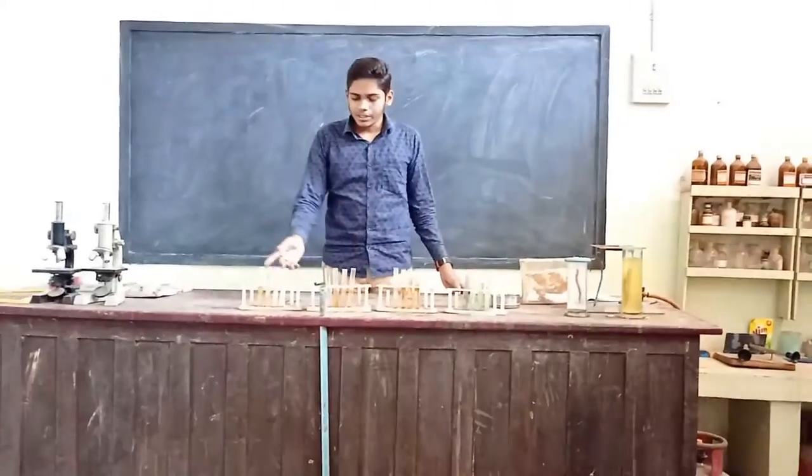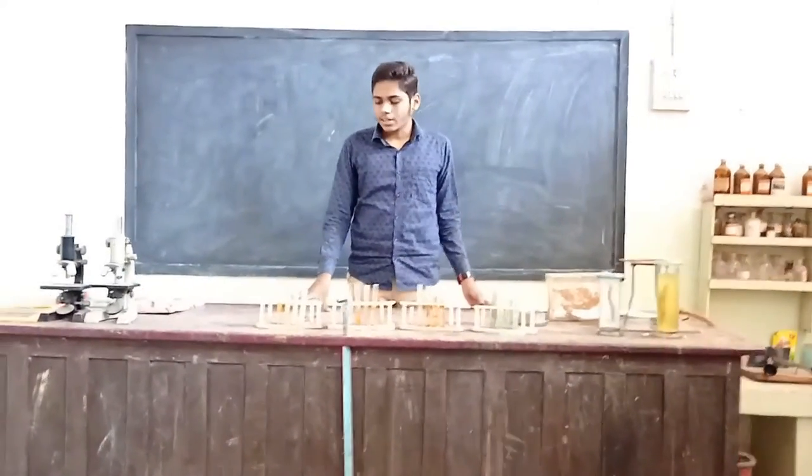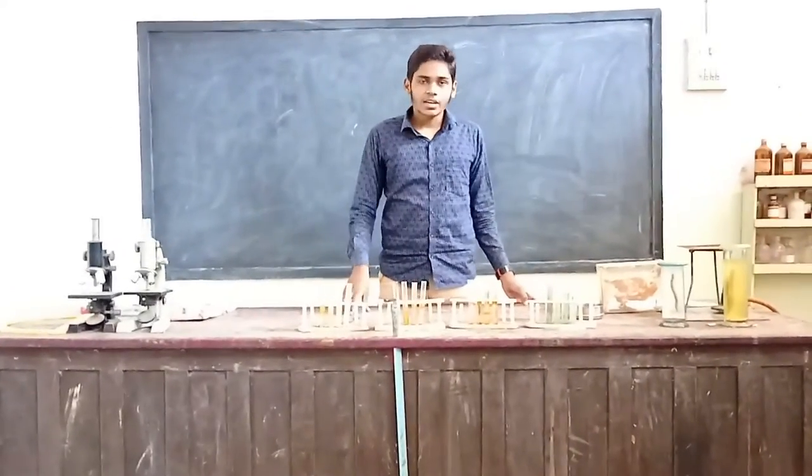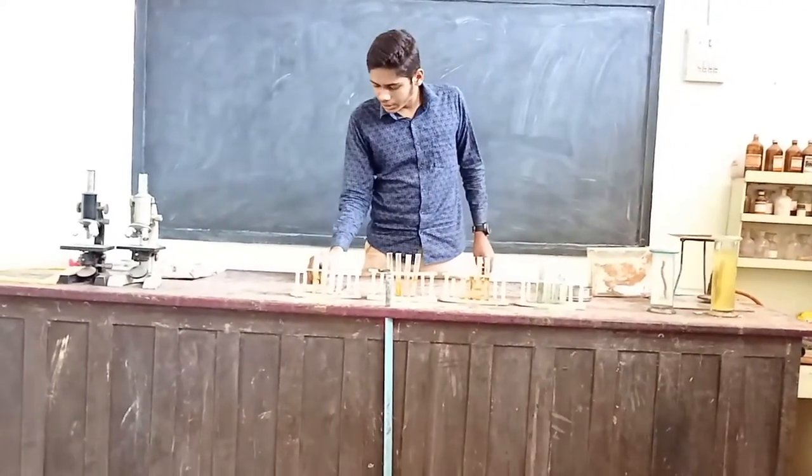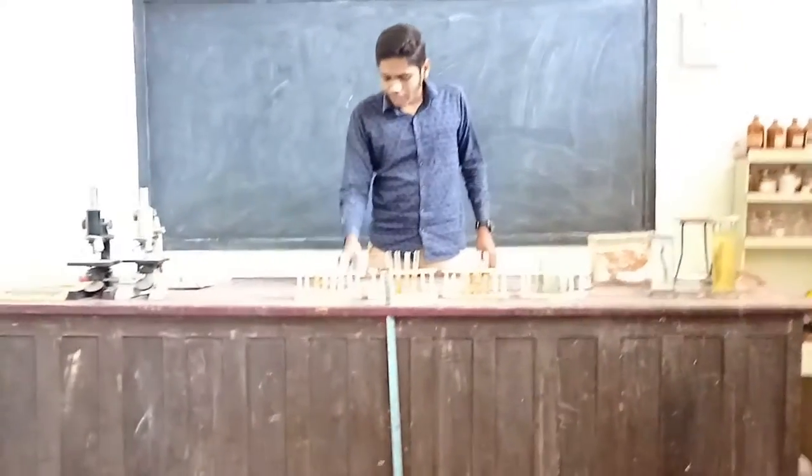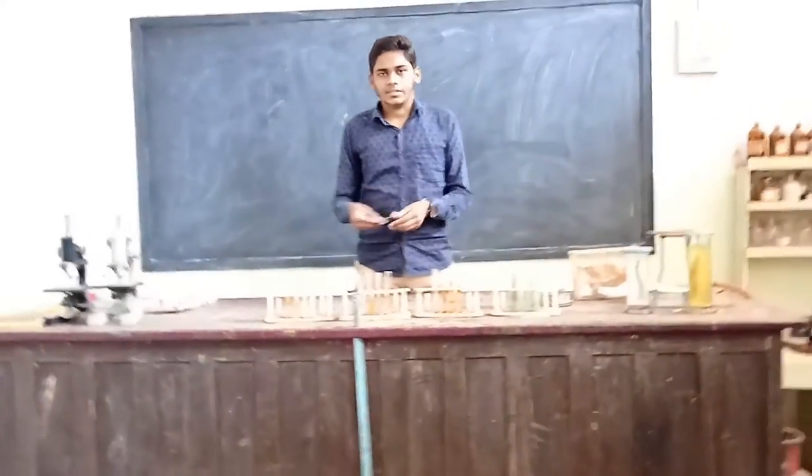So, we need 16 test tubes and the chemicals: Aluminium Sulphate, Ferrous Sulphate, Zinc Sulphate and Copper Sulphate, and 4 strips of each metal which are Aluminium, Ferrous, Copper and Zinc.